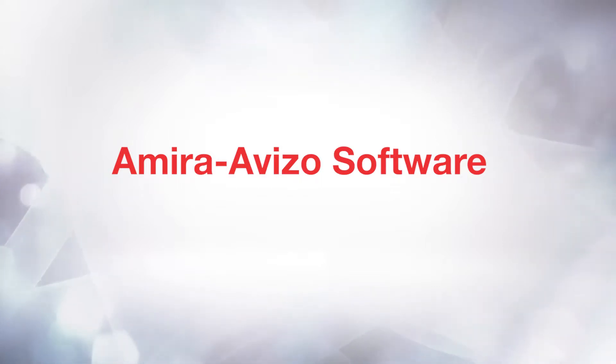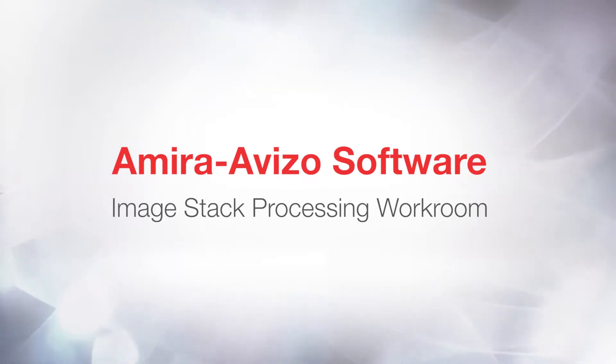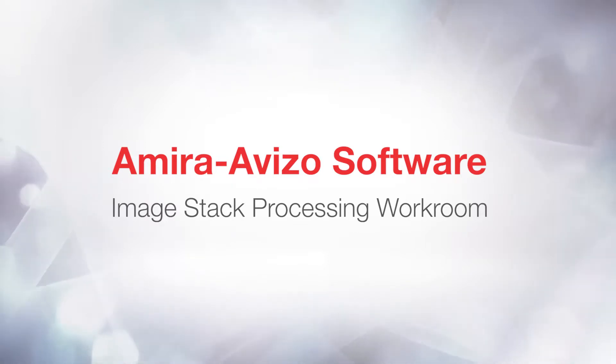Hi, this is Severine from the 3D Applications team. Welcome back to the image stack processing tutorial. The image stack processing workroom is a very intuitive and optimized 2D setup to enhance and segment data in Avizo and Amira.